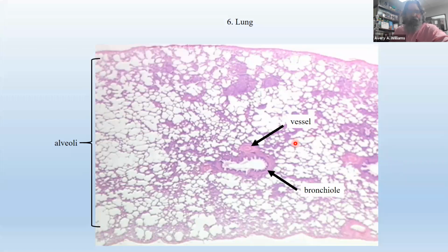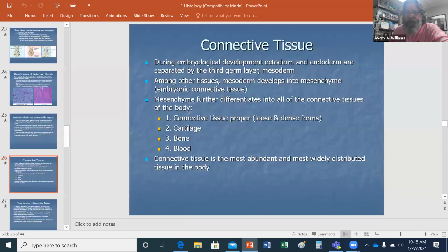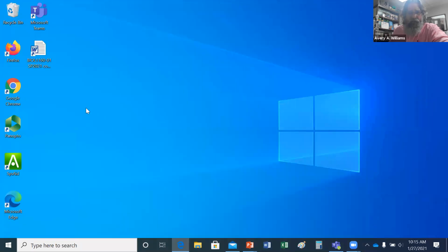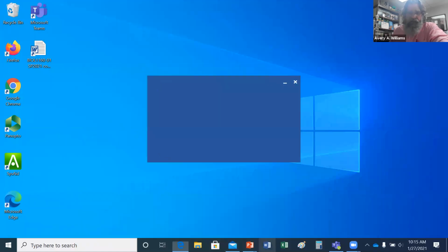But you know what? I gotta look at something real quick. Let me do something. I'm going to show y'all. Did I show you? I can't remember if I showed this class your checklist of tissues. Let me open that real quick. I thought I had it open. I guess I don't. Let's see.